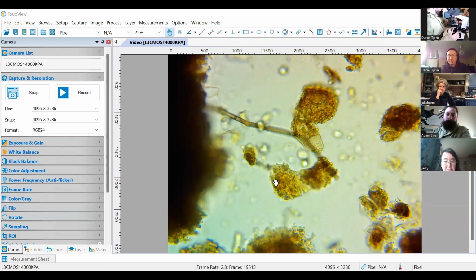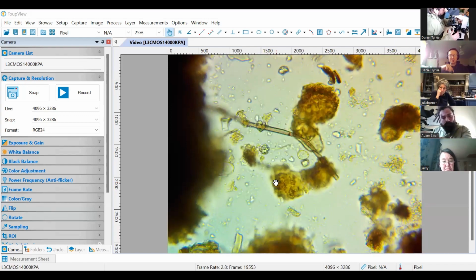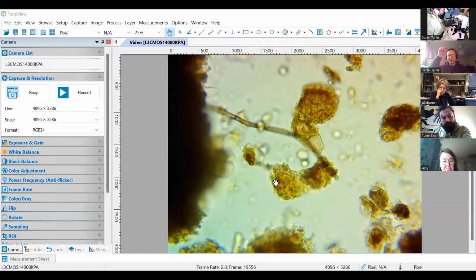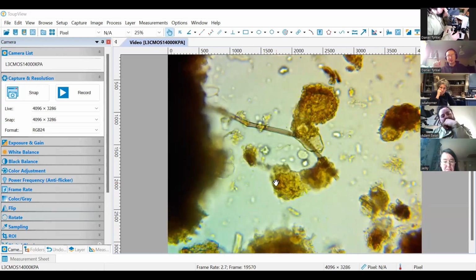But when you're doing this count at 400 times magnification, your field of view is much, much smaller. And so you will not be able to scan the entire slide. You won't be able to count all of the fields of view because there's over 2,000 of them. So now you have to choose only 20 to 25 of them, and you have to fit yourself within that number.